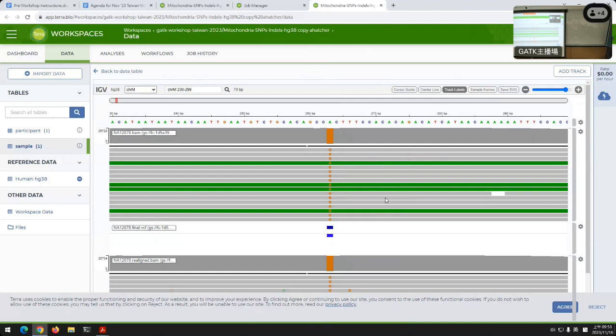I guess in summary, what's good about mitochondrial calling? Like I said, you actually have good confidence in things when they come out of this. That massive depth is good. When you see something there, you're pretty sure. You figure out the NUMTs, okay, they complicate things, and you have to do the alignment, but the pipeline does that for you.